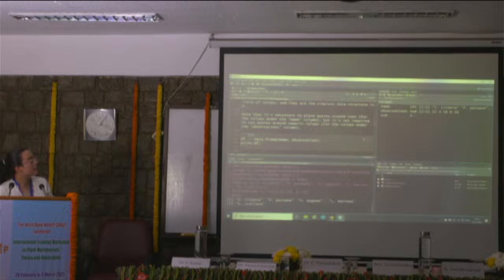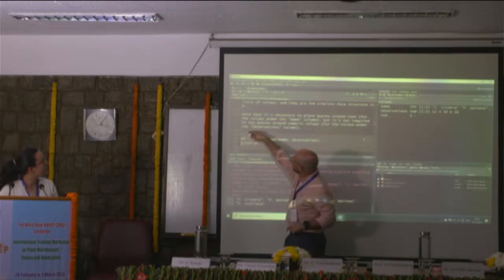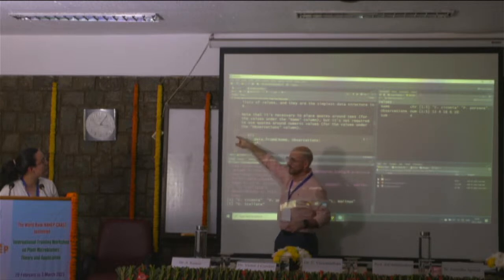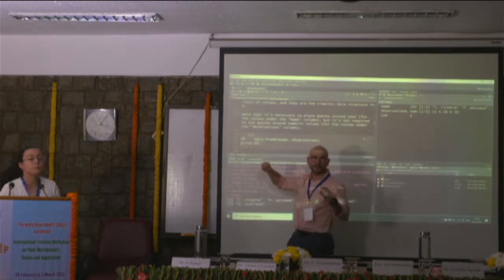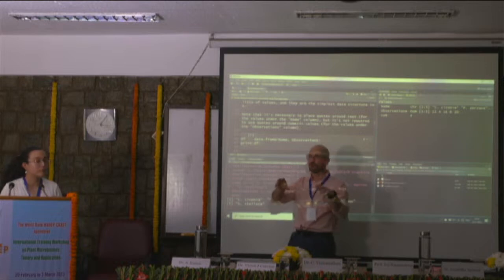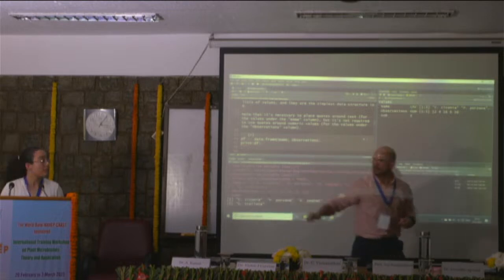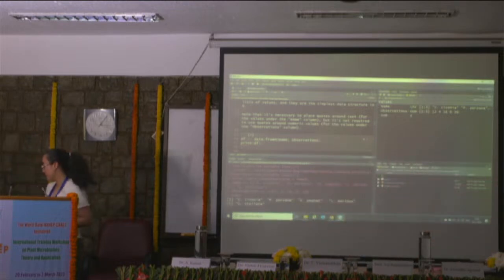So, just one little thing. Focus here on the left side where you have the line number, because before I was somewhere there and we were in the wrong line number, and that's why it was not working. So focus on the left line numbers, so you will have to run from line 45 to 47, okay? Sorry, Luisa. Yeah, no, that's great. Great addition.